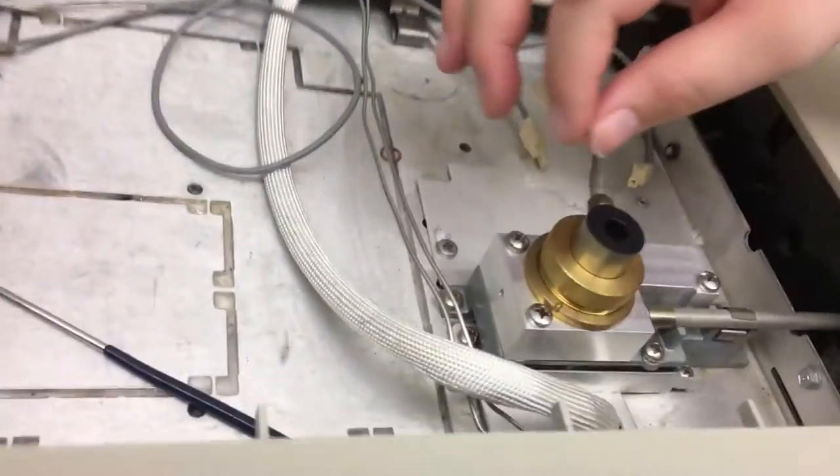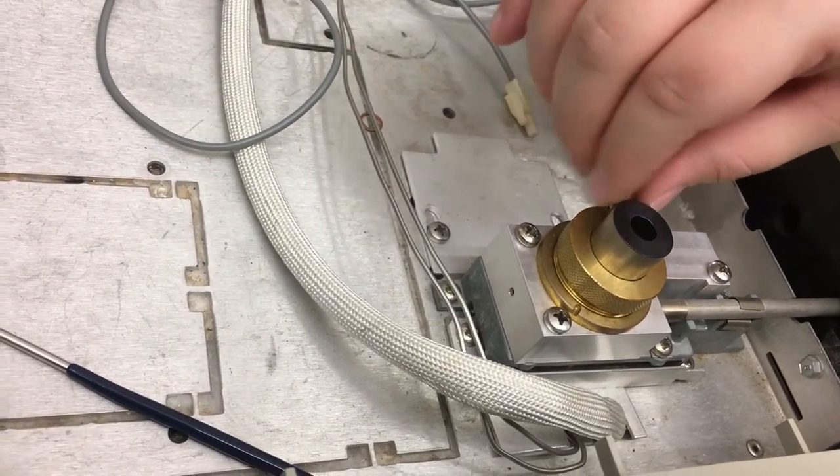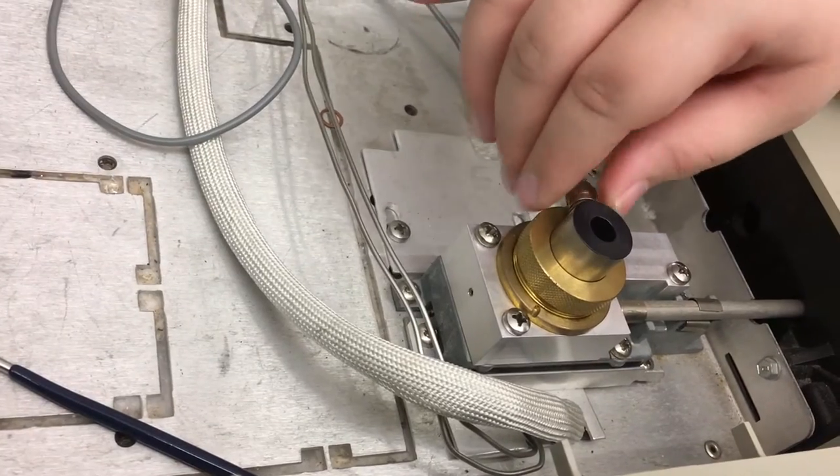In order to properly clean the flame ionization detector, it must be taken apart and removed from the GC unit.